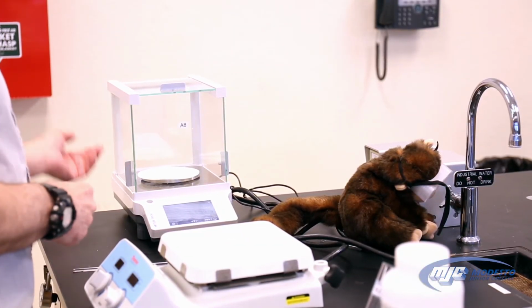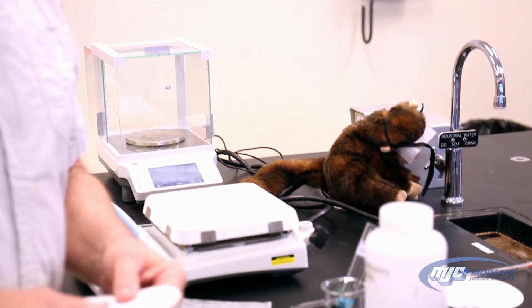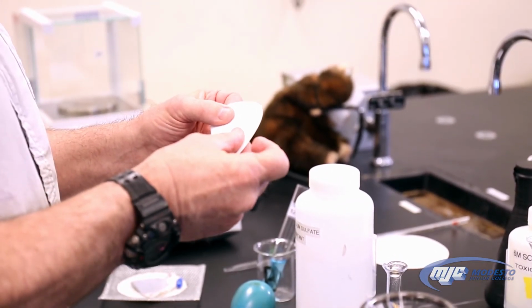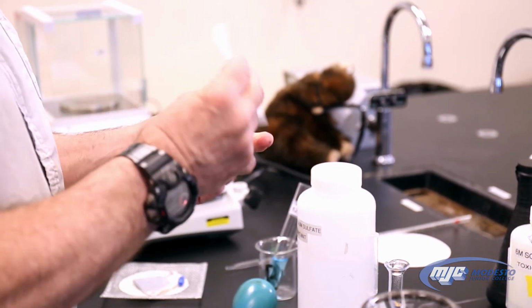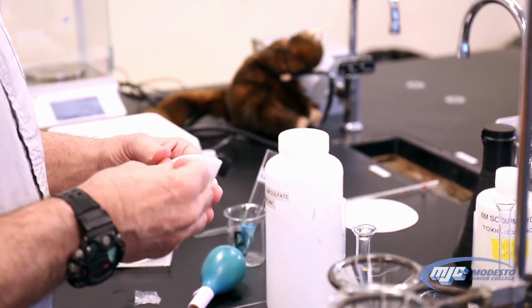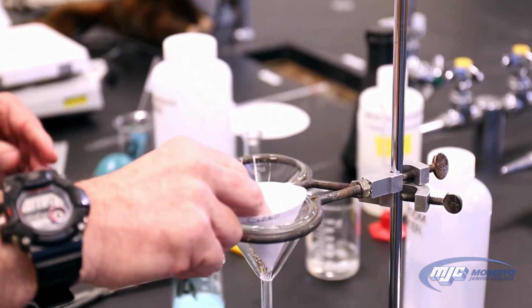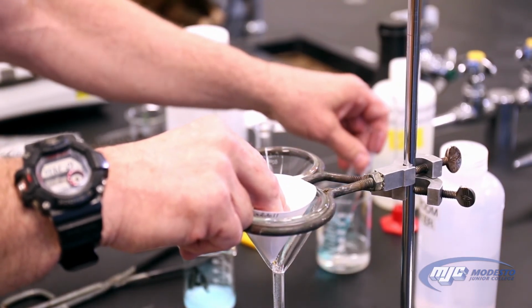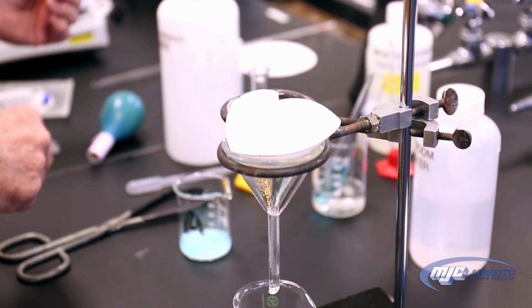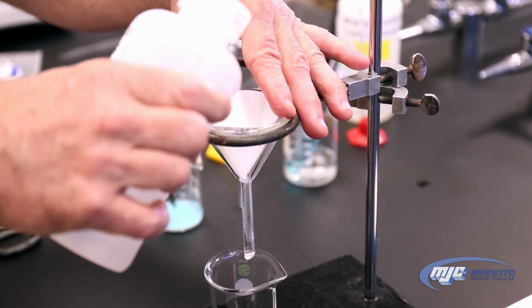Place it on there. This number also goes in our data table. Just like before, we're going to fold up our filter paper into halves first with the name on the outside, halves again. Open it up like before, place it in our funnel. And we're going to have a second 100 milliliter beaker, which we put underneath there. And we're going to again get the filter paper wet so it doesn't keep popping up like that.